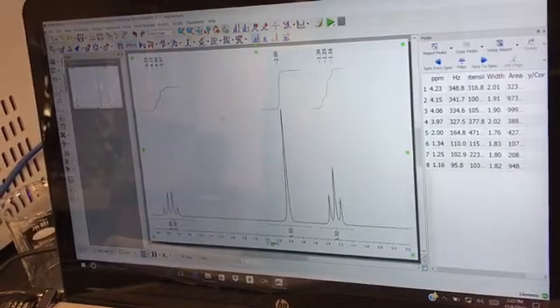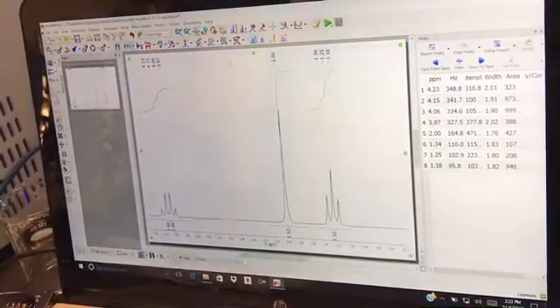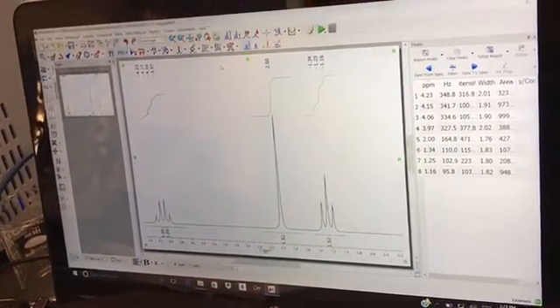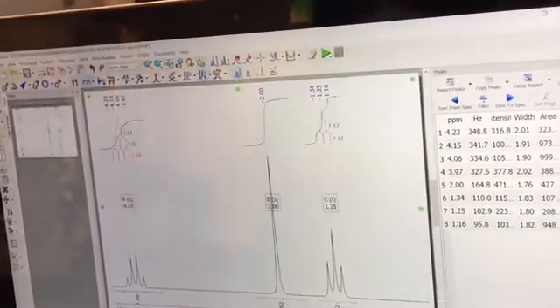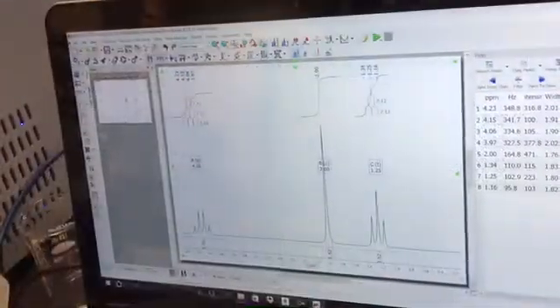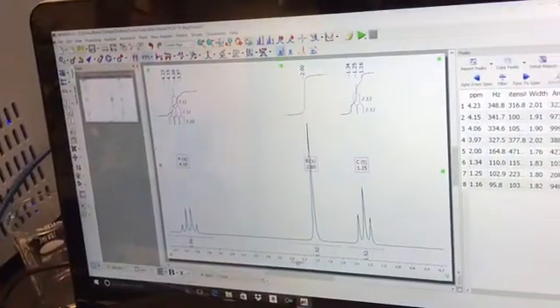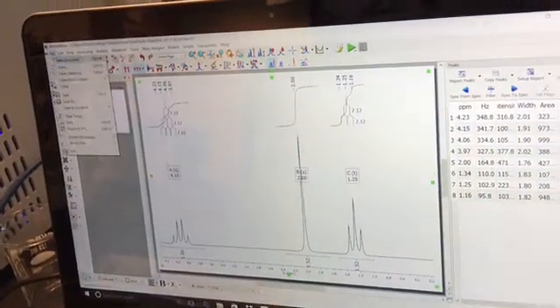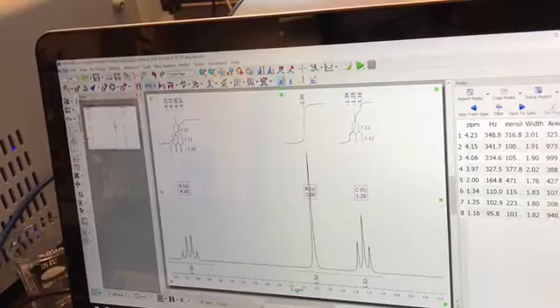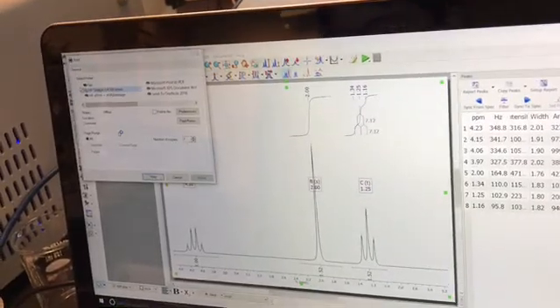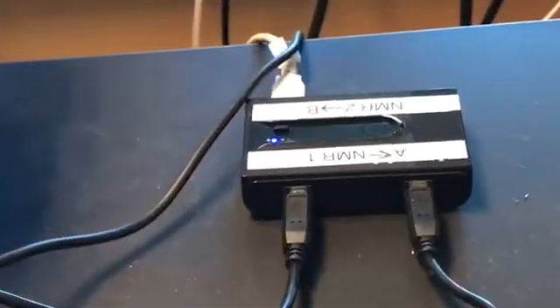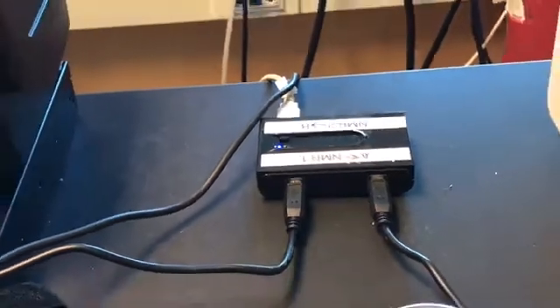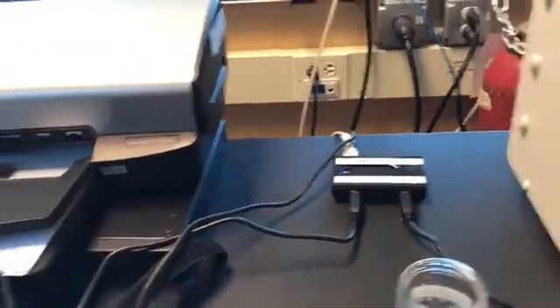Next, on the taskbar, you're going to click the J Multiplet icon to assign multiplets and chemical shifts. Now you can print your spectrum. So you can go to File, click Print, and you want to make sure that your printer switch is set to A if you're using PicoSpin 1 and B if you are using PicoSpin 2. If it's on the correct switch, you can just print it out.